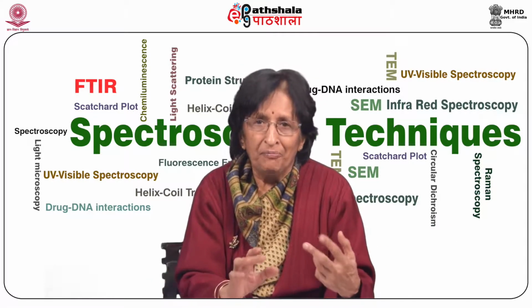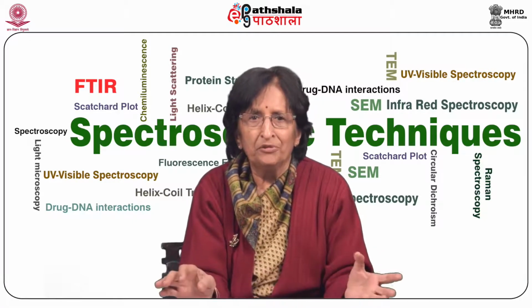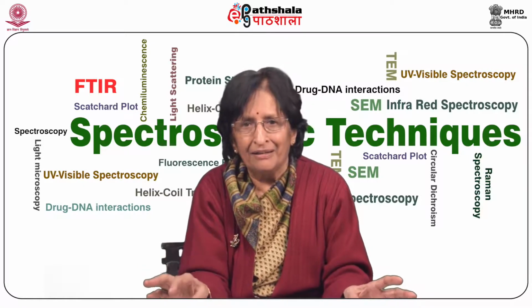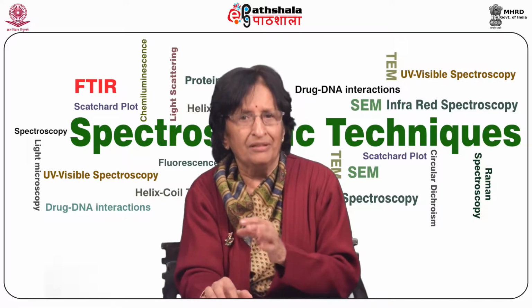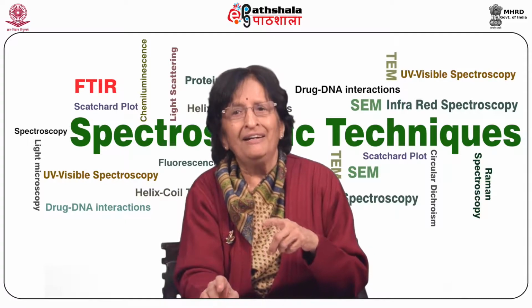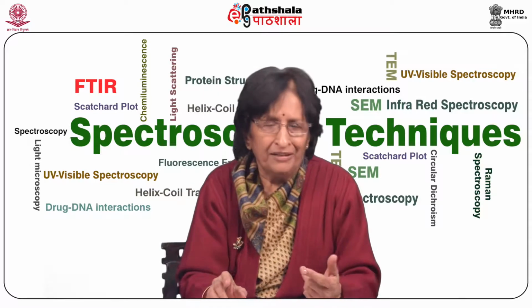So one should measure absorbance, that is generally the practice, from 230 to 320 nanometer to discriminate all the contaminants. The most common purity calculation uses the ratio of absorbance at 260 nanometer and at 280 nanometer, like A260 upon A280.